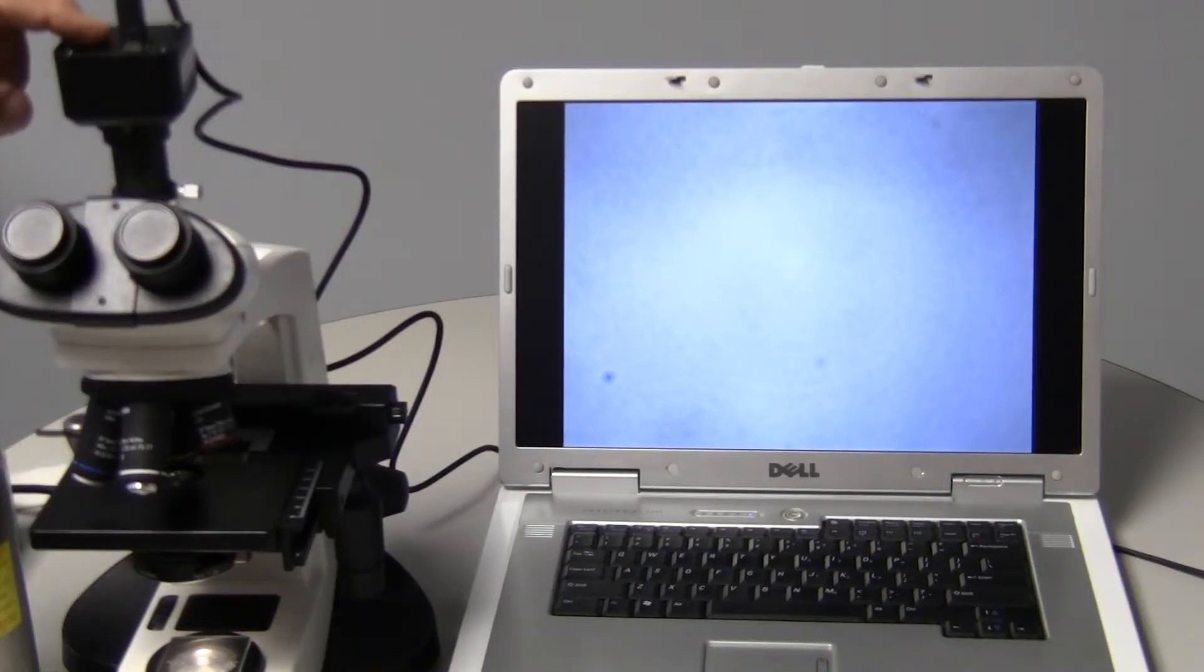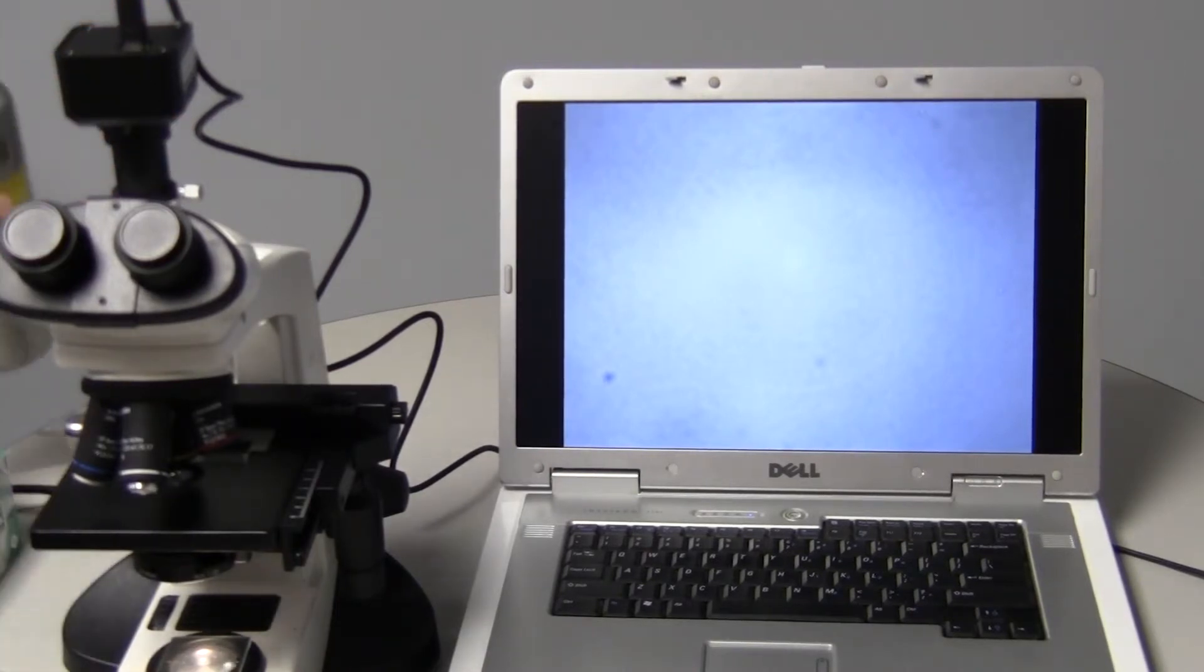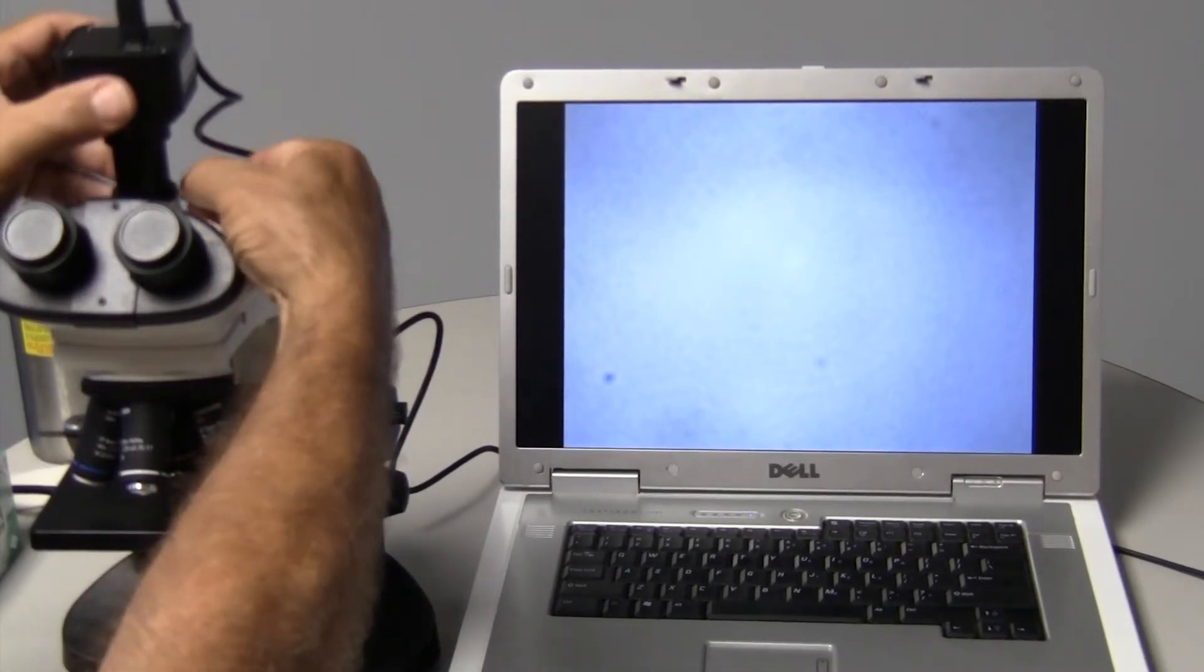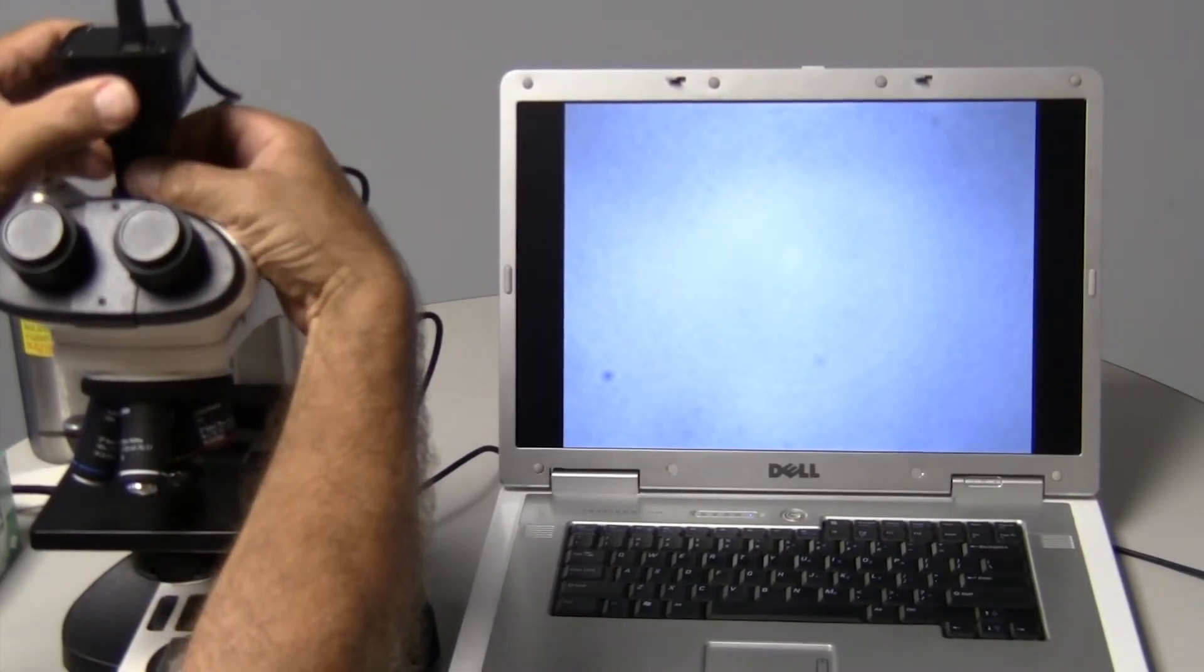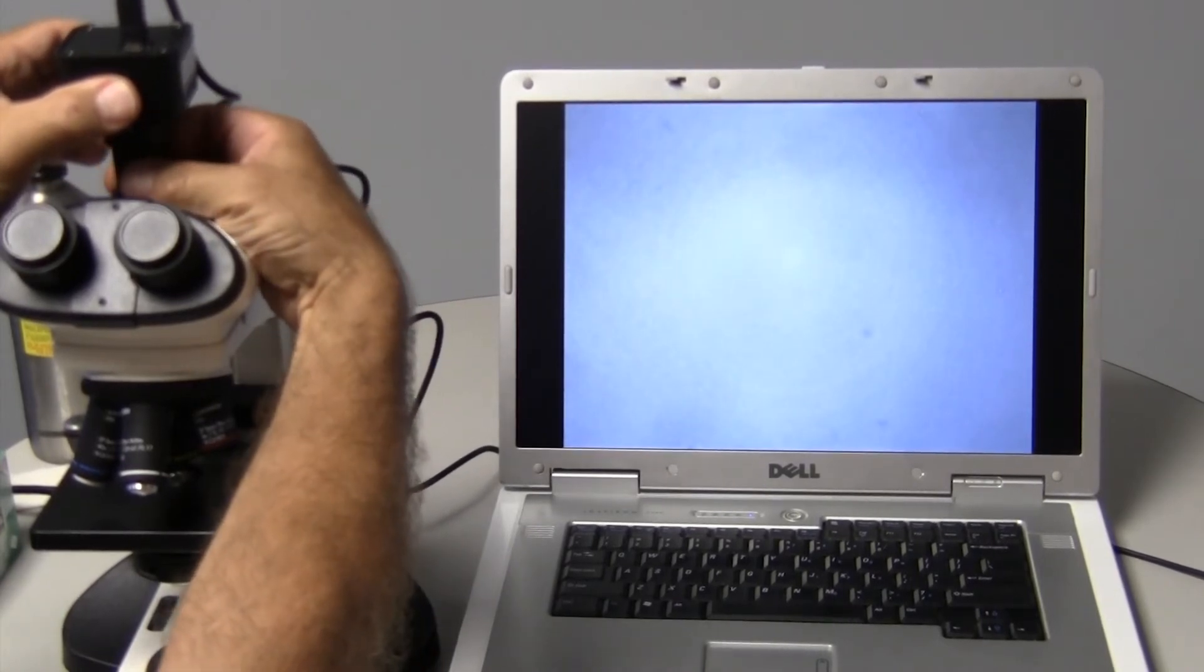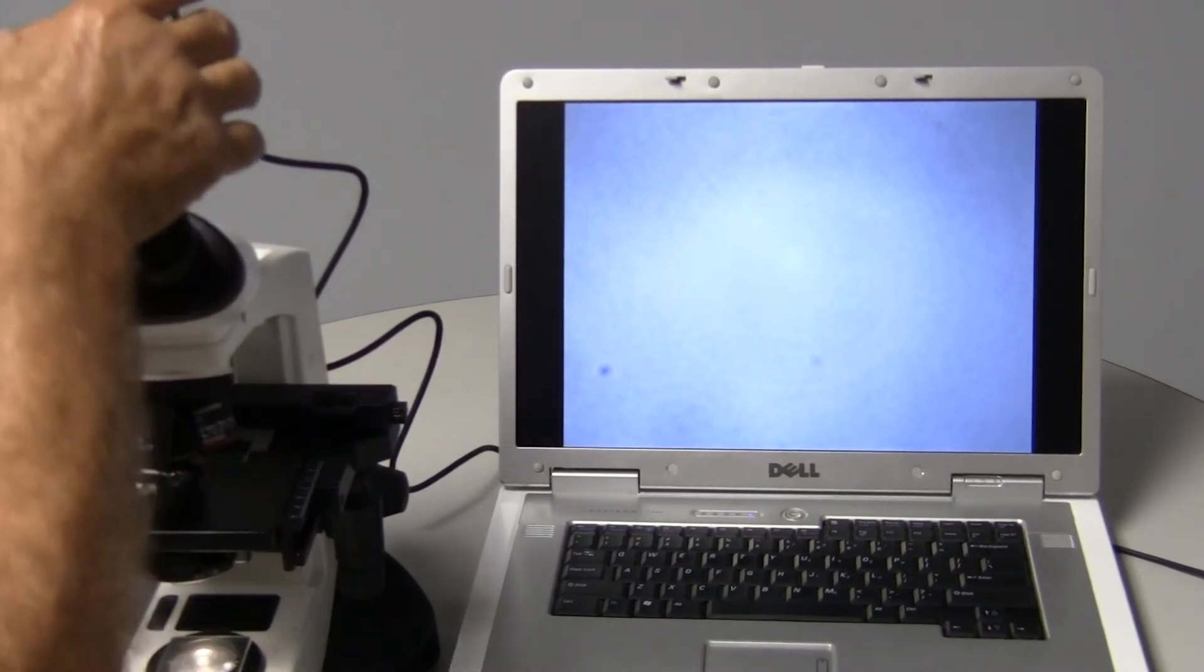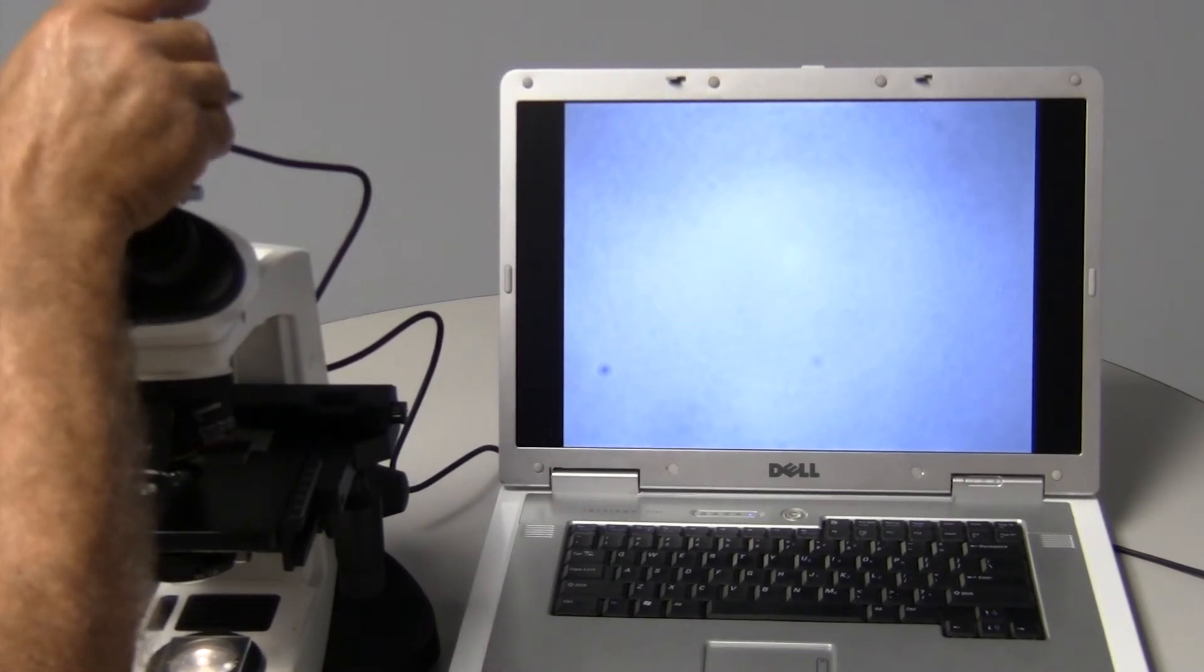Okay, now we have the camera and the intermediate tube assembled back on the microscope. Nothing's been changed in the meantime. So what you can see now is that we have significantly improved the dust and the dirt on the image. Again, I'm going to move just the intermediate lens here. And you'll see that there is a little dirt in the field. It's very, very difficult without perfect laboratory conditions to get a lens perfectly clean. But you can see we've made a significant improvement.